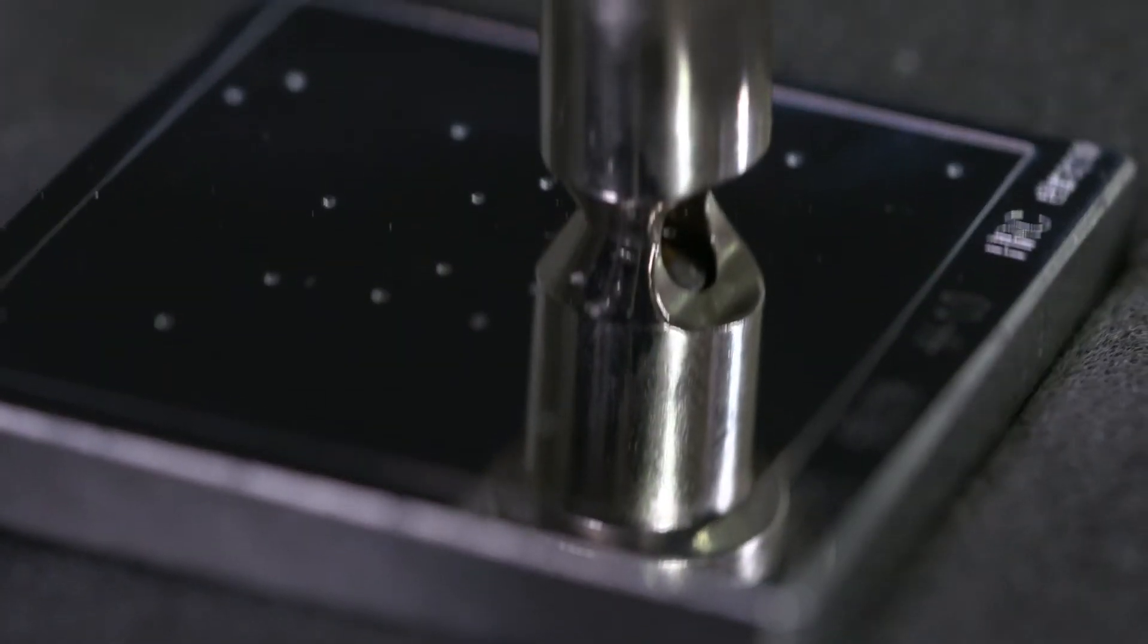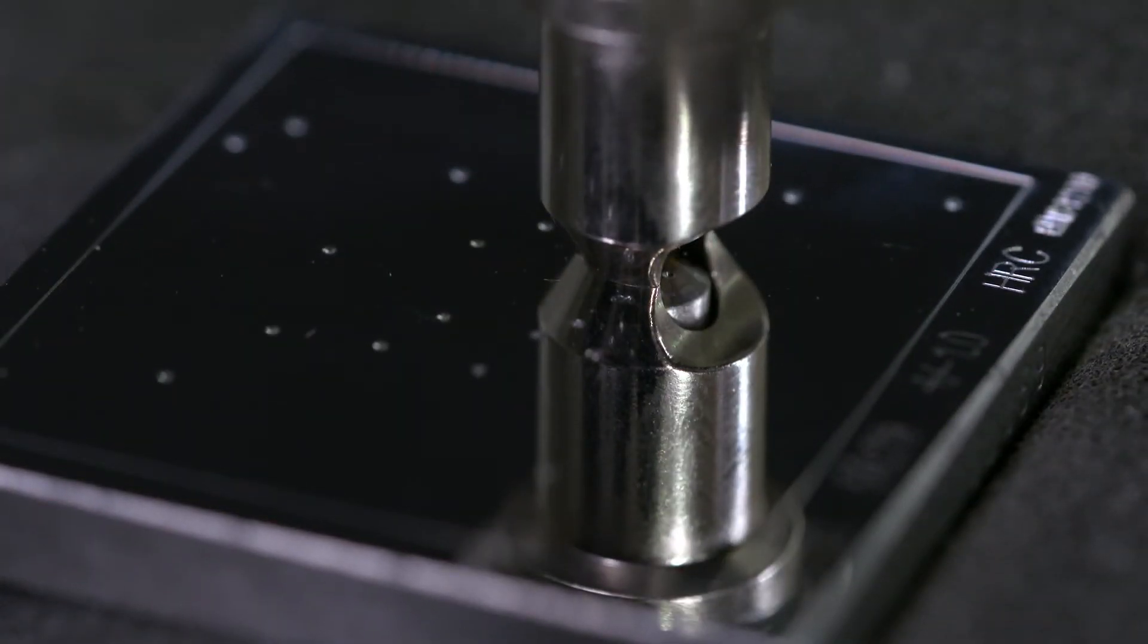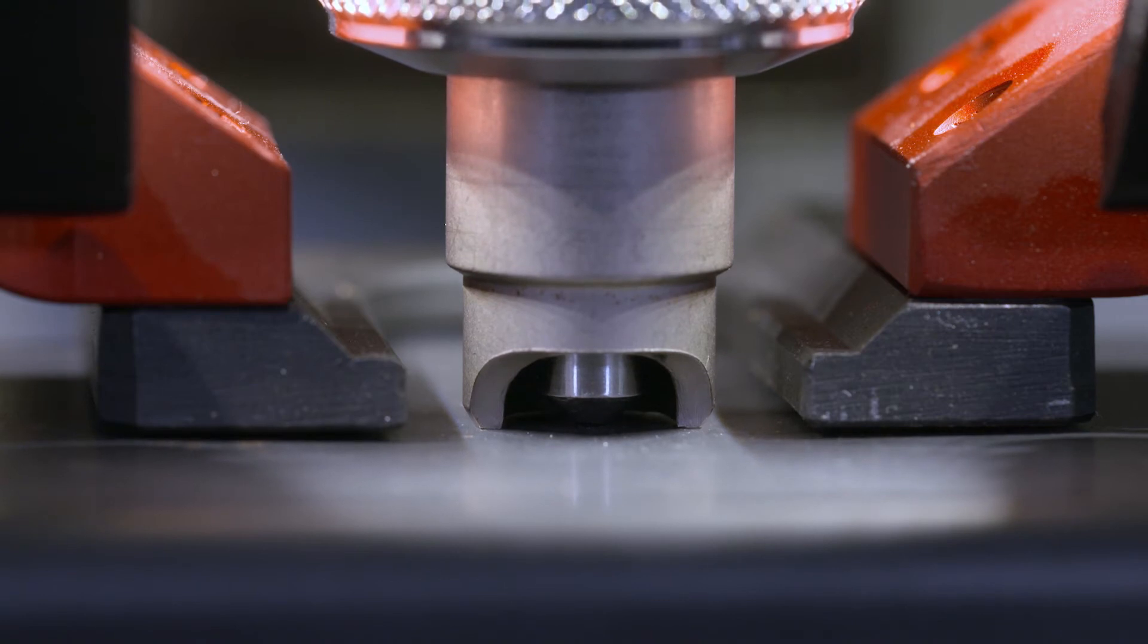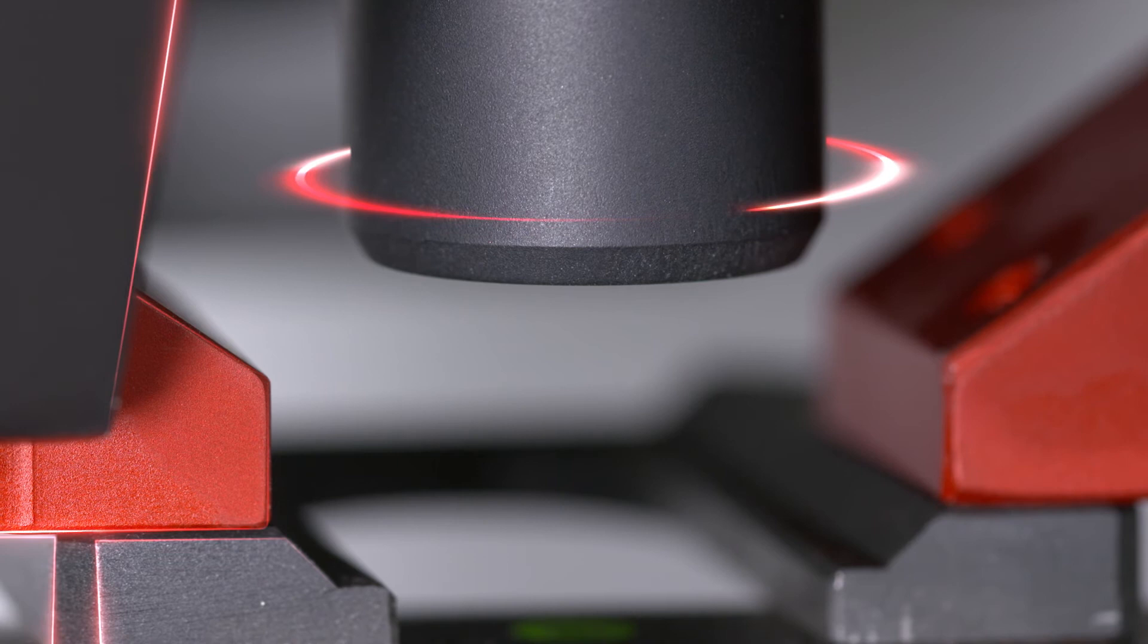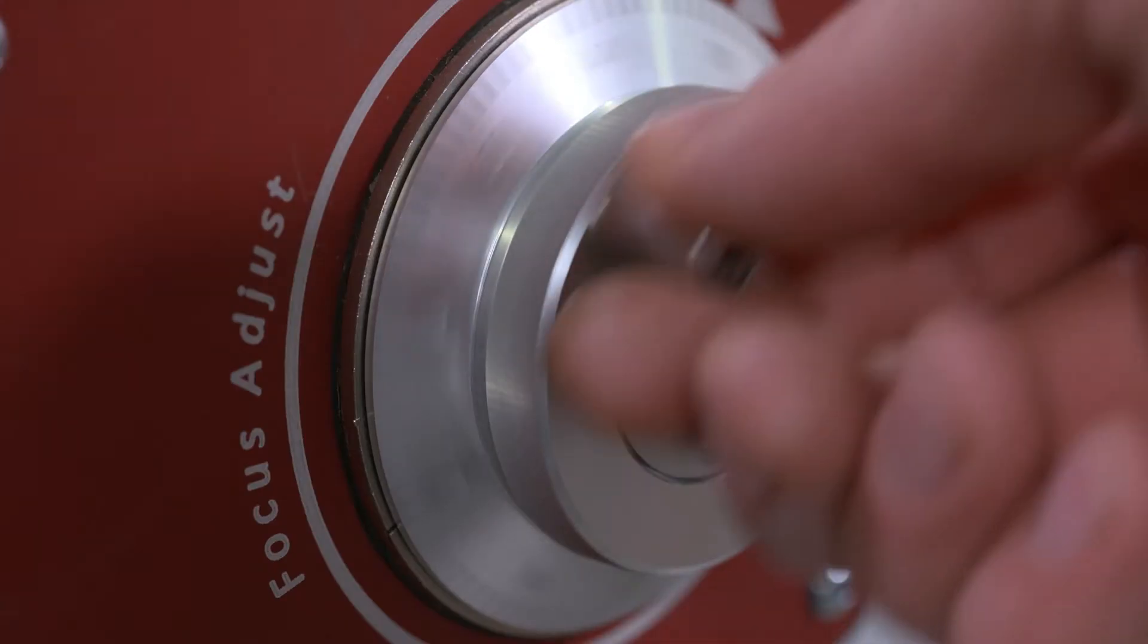In the event of structural failure or bending, the measuring head follows the surface of the piece while maintaining the testing force. It is designed to reduce the margin of uncertainty.